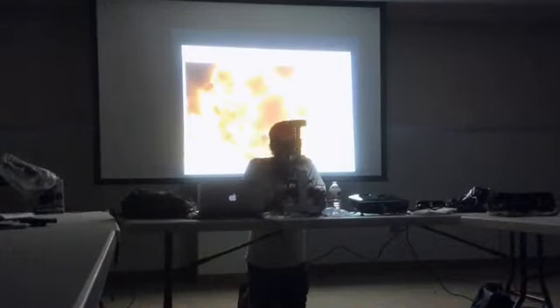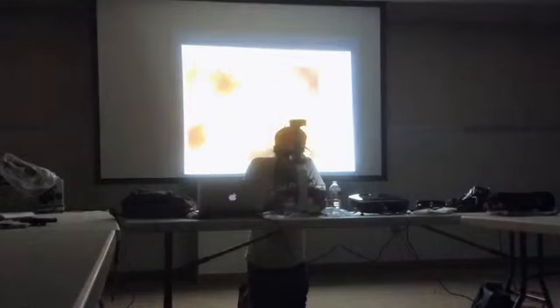So I think that's another chunk of fungus there. Maybe, maybe not. Sometimes it's hard to tell, but I believe that is.